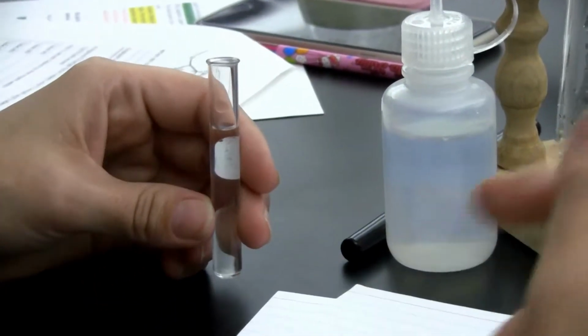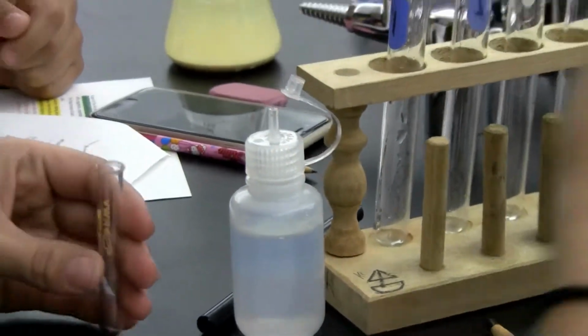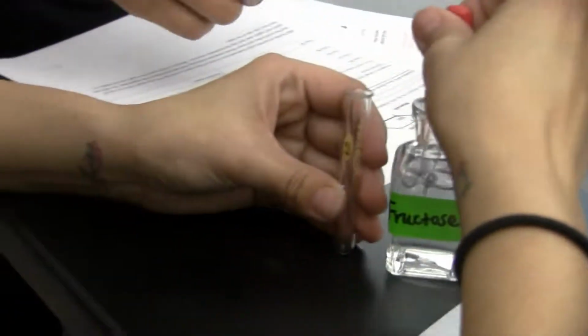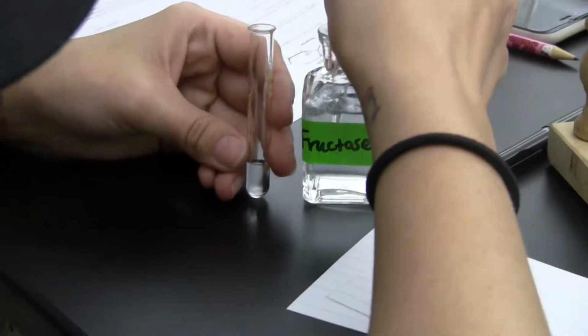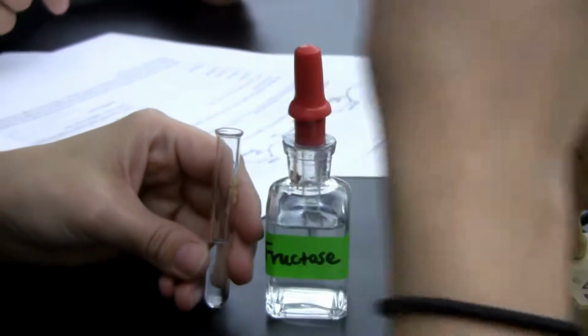The second one is going to be fructose. Glucose. So which one's number 2? Here's number 2. And then there's fructose, right here. And we're filling all of them 2/3 full? Yeah, 2/3 full. We're supposed to add the yeast to all 5. That's what we're going to do, but we'll just fill them up right now.